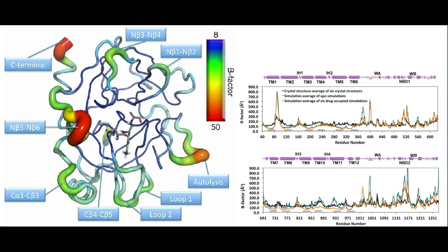backbone being in a position, say, well, this is one that is easy to pick out. This has a high B factor, which means that this is our protein chain here. So this means that the protein chain is sort of flopping around here. High B factor is, like I said, sort of a floppiness factor.